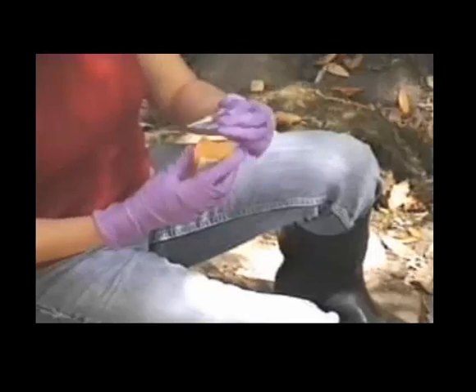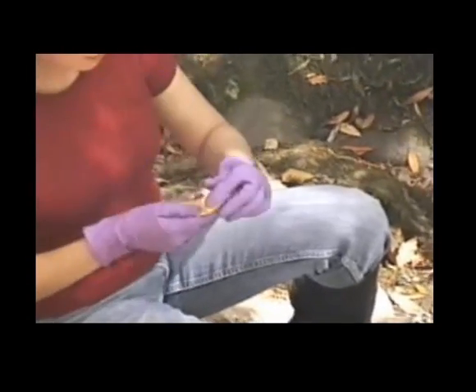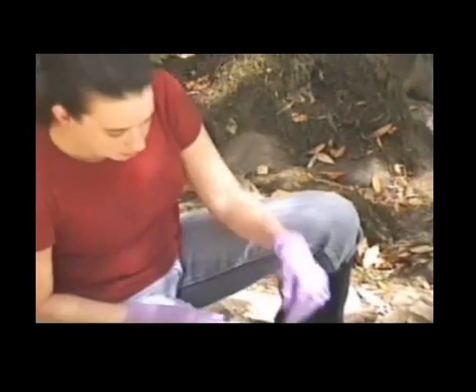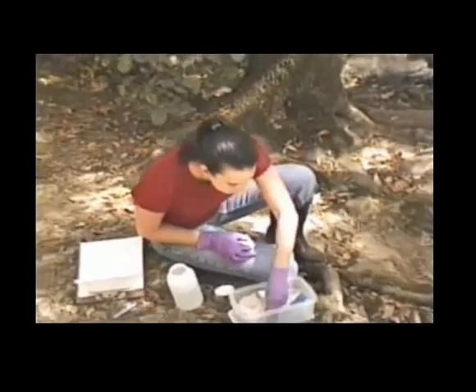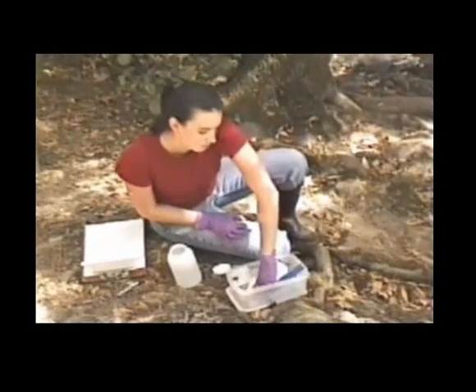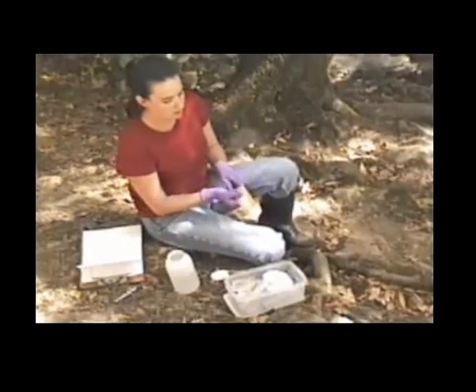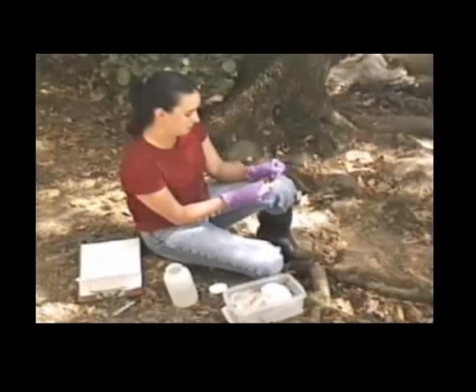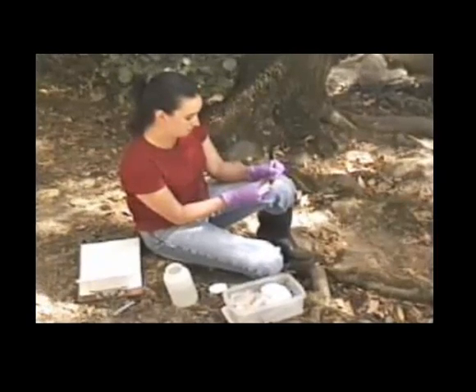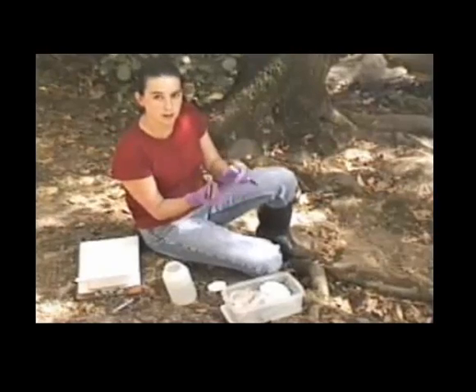And put it into your labeled envelope, sealing it. Remembering to write the volume of water that was put through the filter. And in this case, we did 120 milliliters. And then we're going to take this back to the cooler and put it on dry ice.